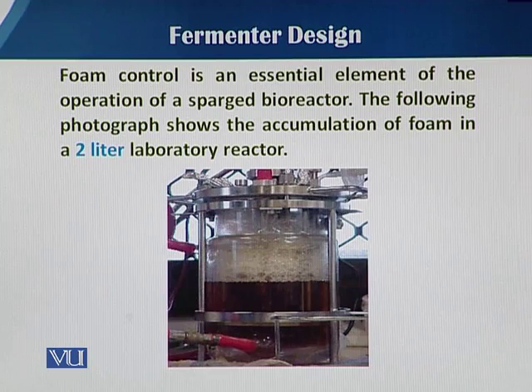When the mixing and agitation system and the oxygen delivery system work together and the process is going on, then depending upon the nature of the medium, foam will be produced. As you can see in this picture, the head space is totally filled by the foam. This is just an example of a 2-liter laboratory reactor.